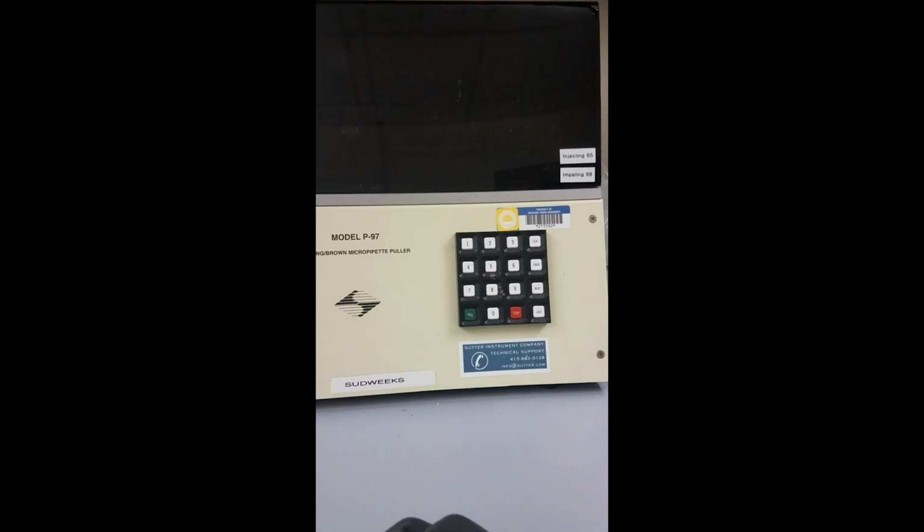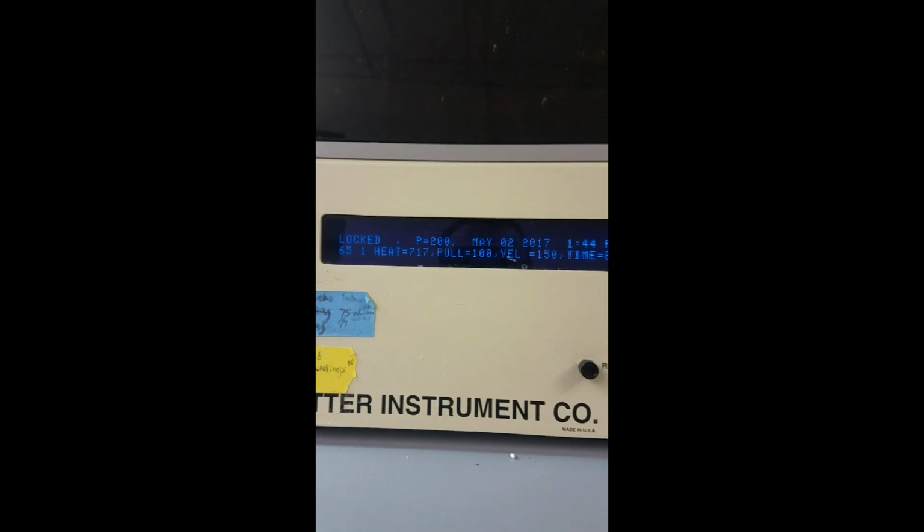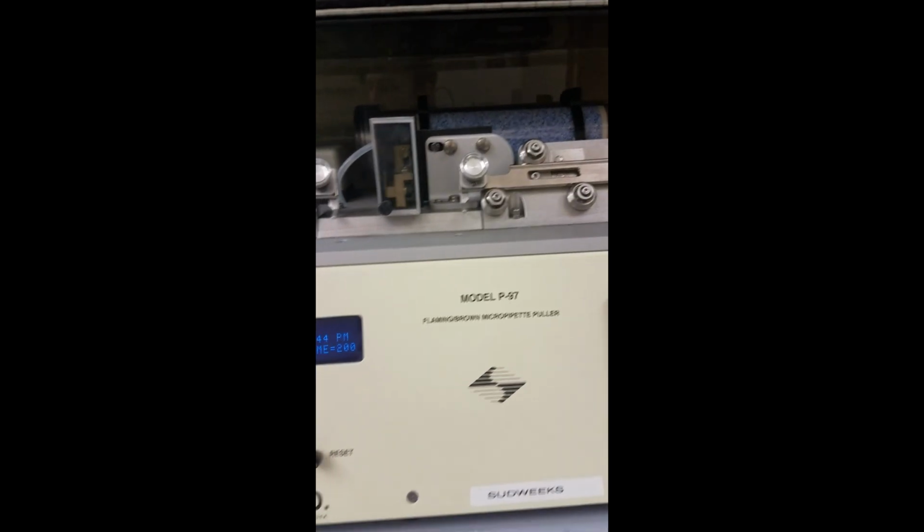So we come over here. It says, what do you want? Here's the number pad. We put in 65 and push enter. And you can see that the correct program pulls up. We'll open the top.